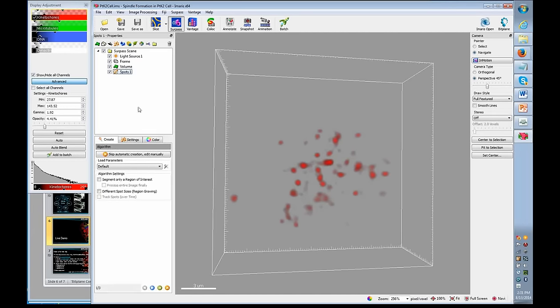And for some objects, instead of settings initially for visualization, you get a creation wizard down here, an object detection wizard. And if you had used some other settings previously, you could save them and recall them, or you can start from scratch. It is possible to set up a 3-dimensional or 4-dimensional region of interest if you only want to segment a smaller area.